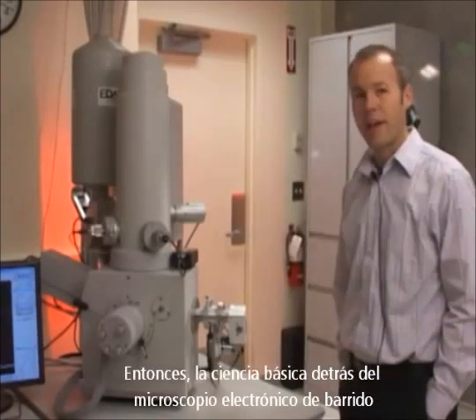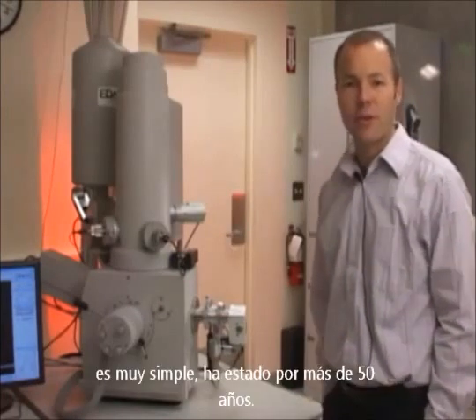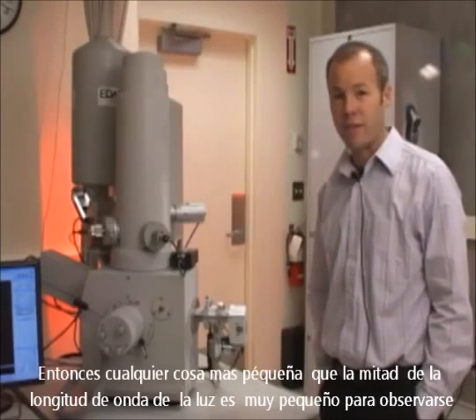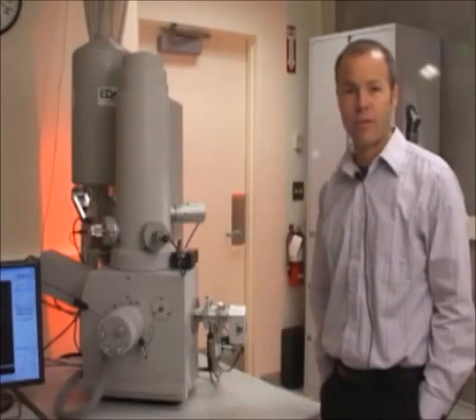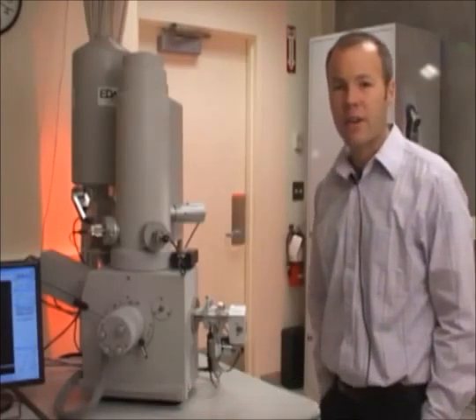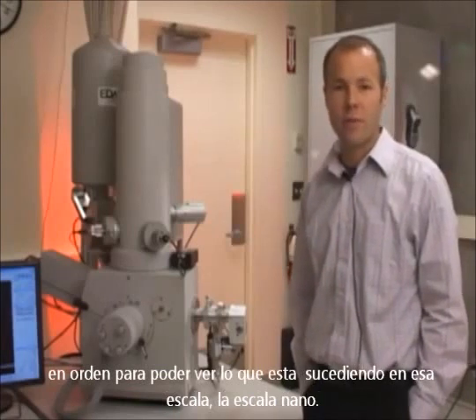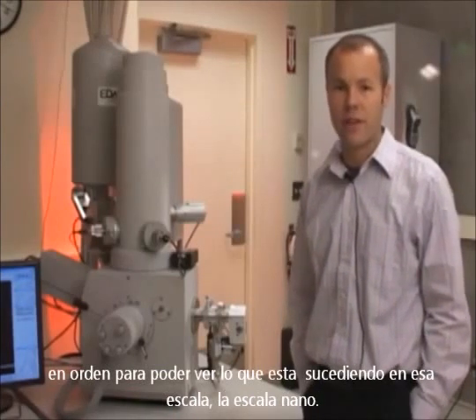The basic science behind scanning electron microscopy is pretty simple. It's been around for more than 50 years. It's a way of beating the diffraction limit of light. Any item smaller than half the wavelength of light is too small to see with a light microscope. Electrons have a much shorter wavelength, so we're able to image structures that are a lot smaller than the diffraction limit of light, in order to see what's going on at that scale — the nanoscale.